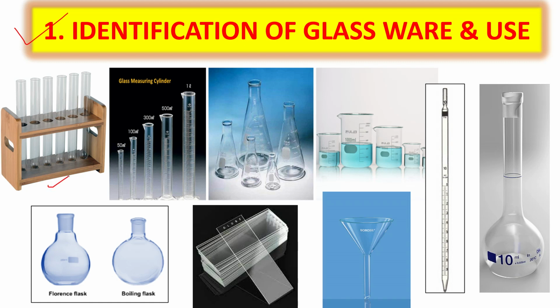What is the role of the test tube and where can we use it, we have to mention. They will show the picture or the test tube itself, and ask you to mention what this glassware is called and what its use is.